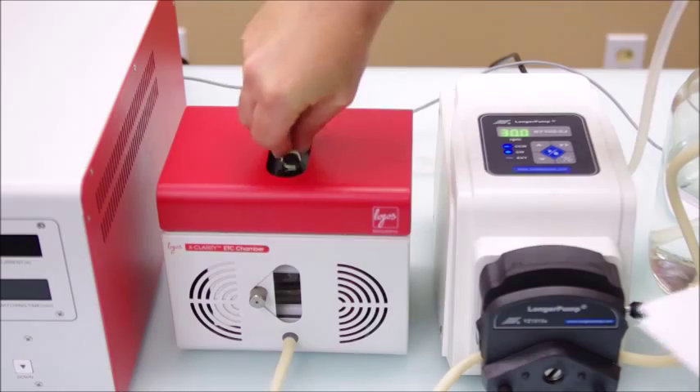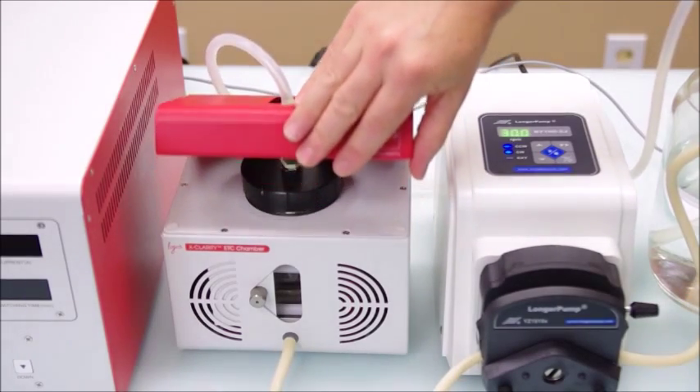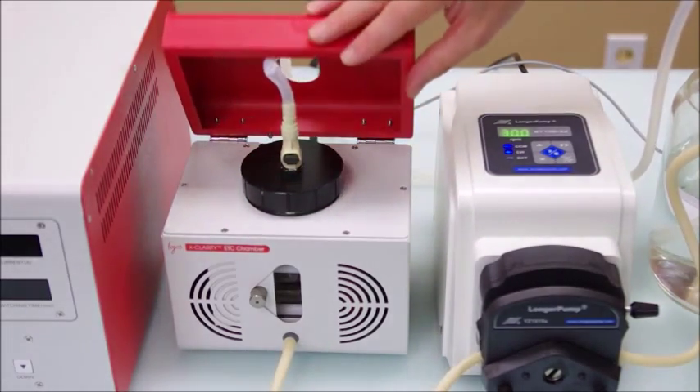And finally, be sure to remember not to open the chamber lid when the outlet tube is connected. You may cut the tube or strip the quick lock.